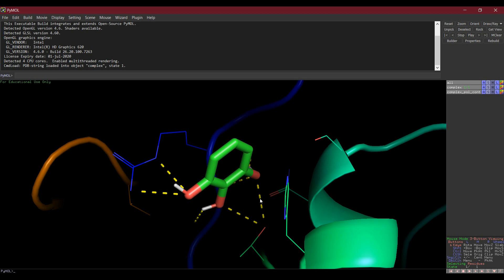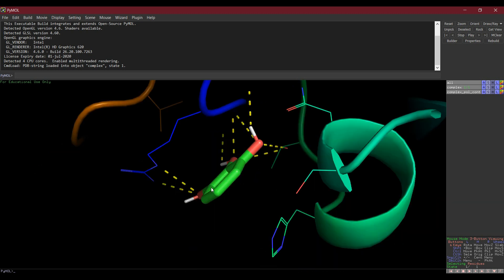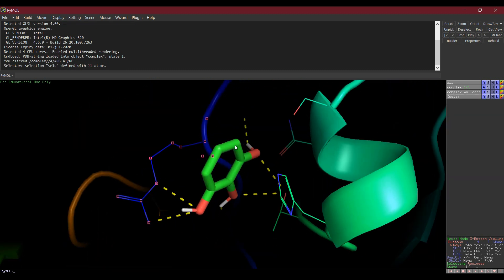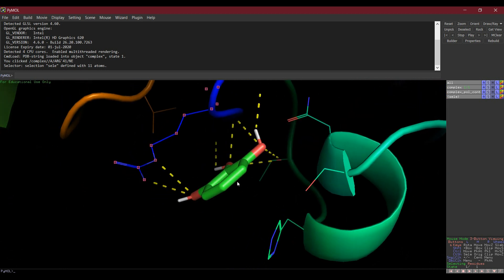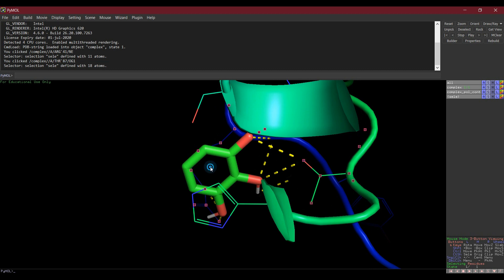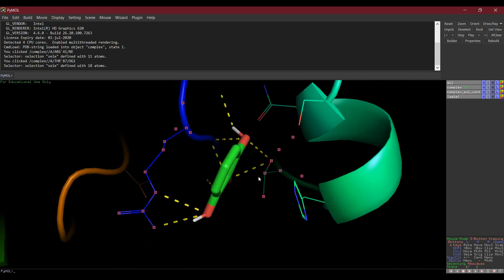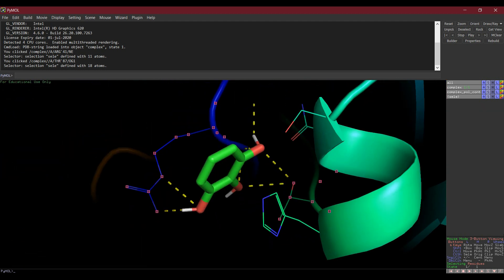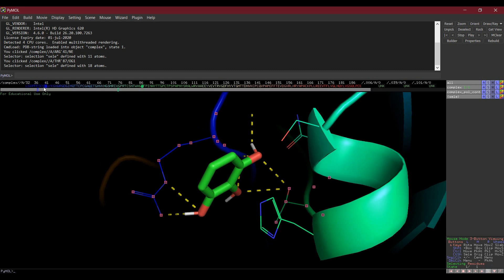You can also check whether these residues are in the binding site of the protein — click on each residue of interest. Then go to the Sequence view, and this will show you the selected residues highlighted.